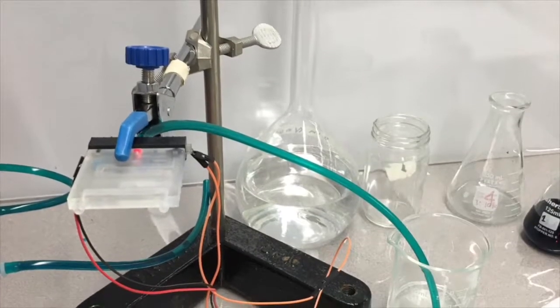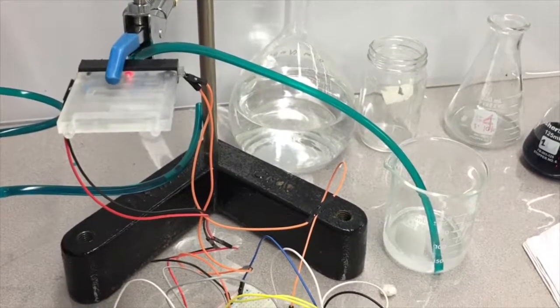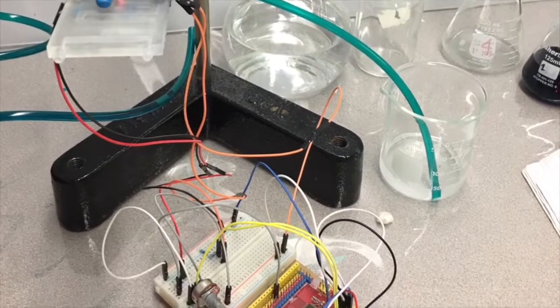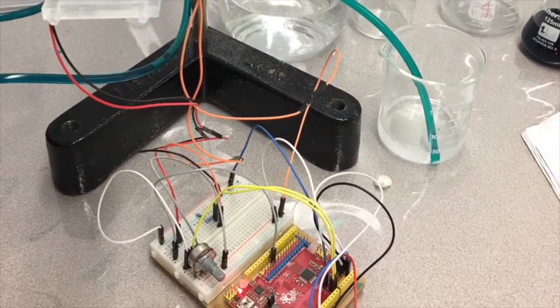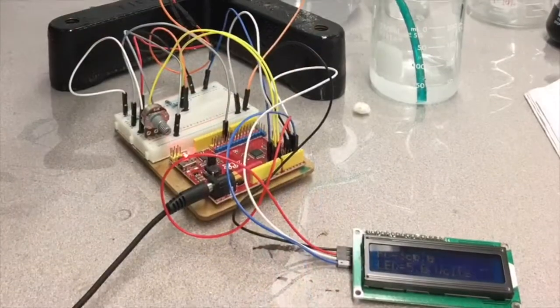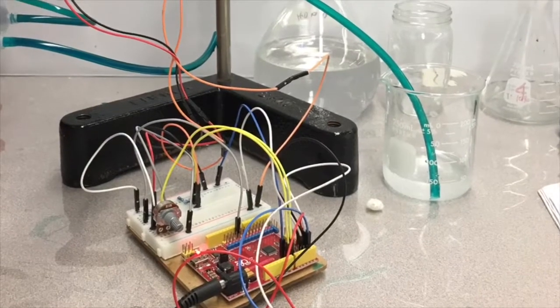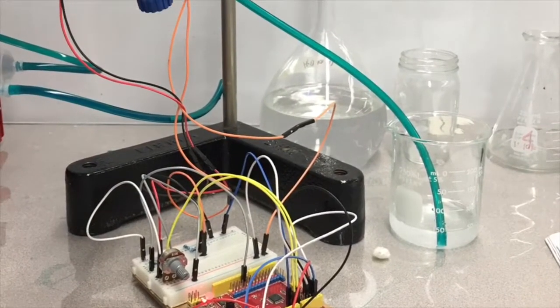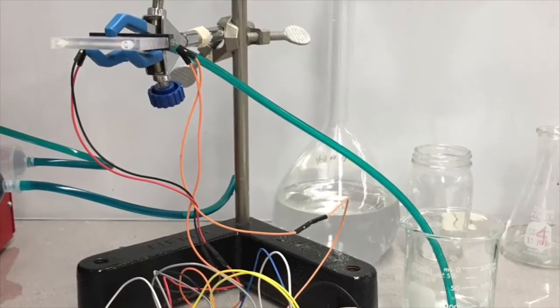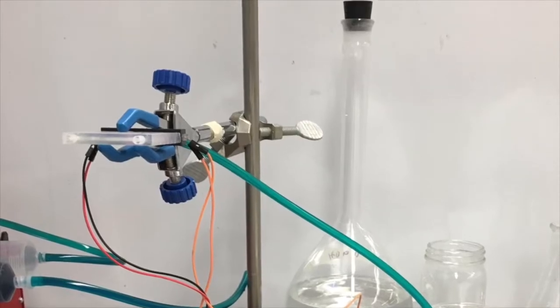The microreactors were designed in SOLIDWORKS and were then 3D printed. We clamped the reactors to a stand and made sure that they were level. We attached both inlets for the malachite green and the sodium hydroxide. A photocell with an LED was attached to the outlet of the reactor in order to get readings through the Arduino. These readings gave us the amount of light that passed through the photocell. Syringes of malachite green and sodium hydroxide were filled to 60 milliliters and were then put onto the syringe pump. The flow rate was set and then the pump was started. We then proceeded to collect said readings.